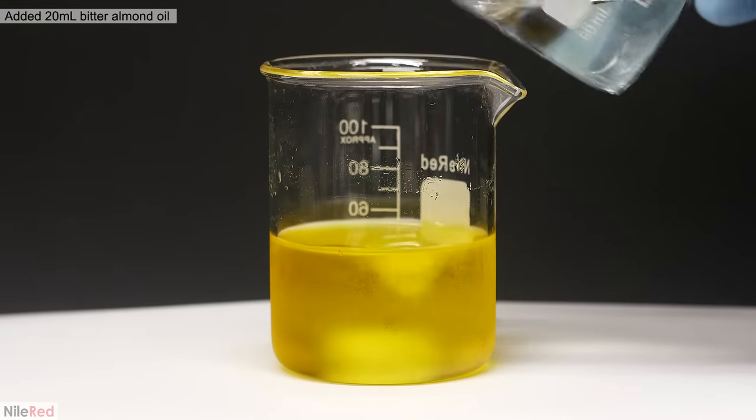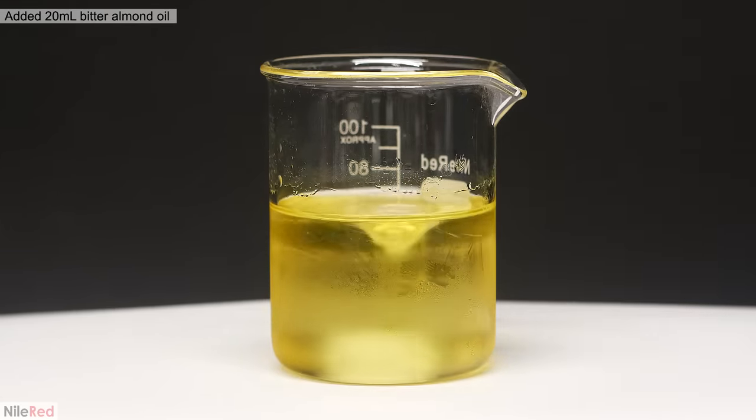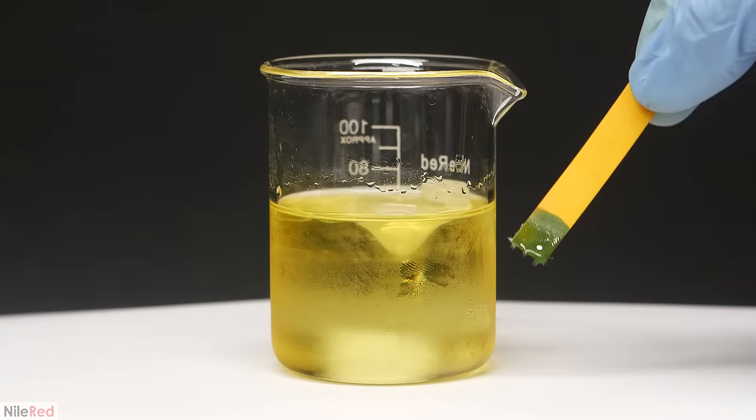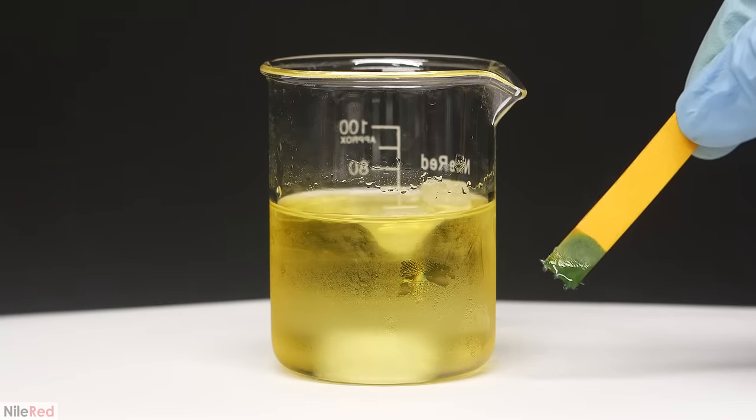When I was done adding it, I let it stir for a bit, and then I poured in 20 mils of the bitter almond oil. Before moving on, I quickly checked the pH to make sure that it was between 8 and 9. This reaction can be quite sensitive, and if it's not within this bracket, the yield would probably be affected.